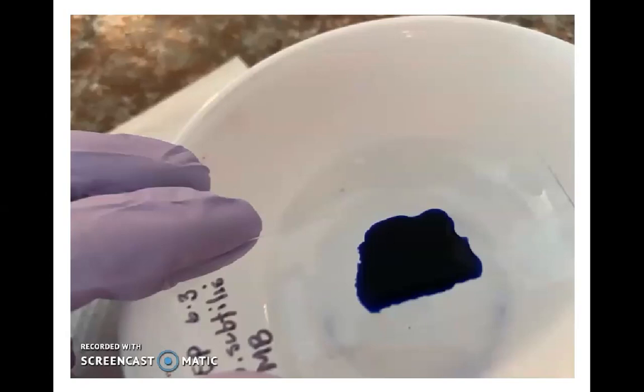Typically, when we're doing a simple staining procedure like this one, where we're applying that one stain and then we're going to rinse it off, it will stay on the slide for about 60 seconds. Now, every stain is a little bit different, and sometimes it'll be a little bit longer or a little bit shorter, but generally it takes about a minute to stain a smear like this.